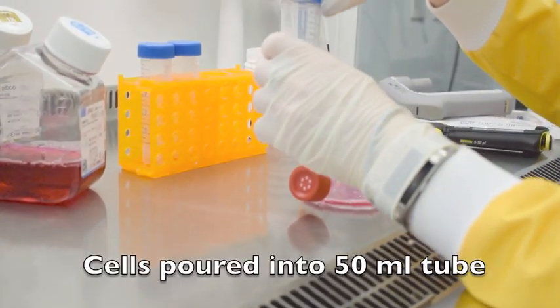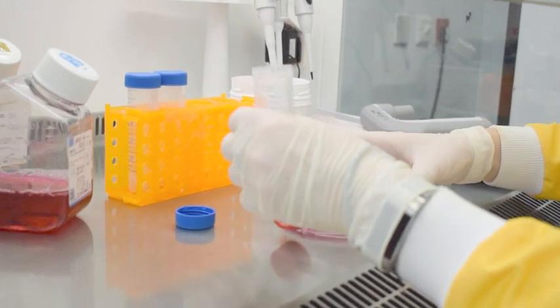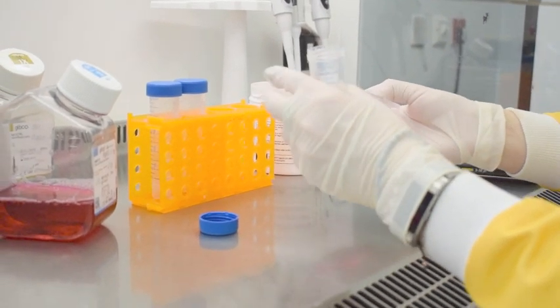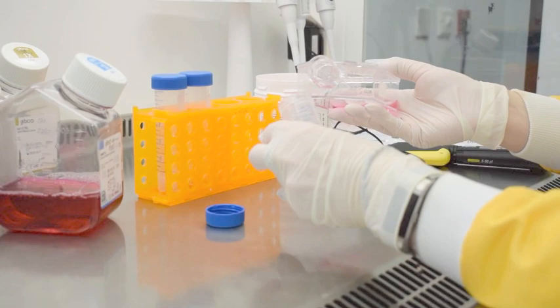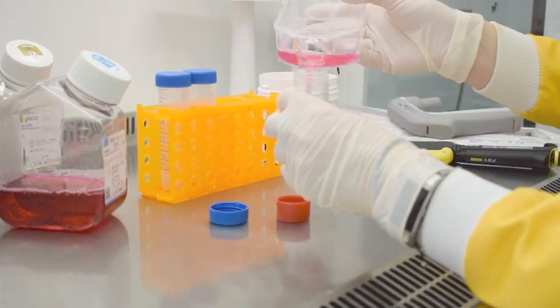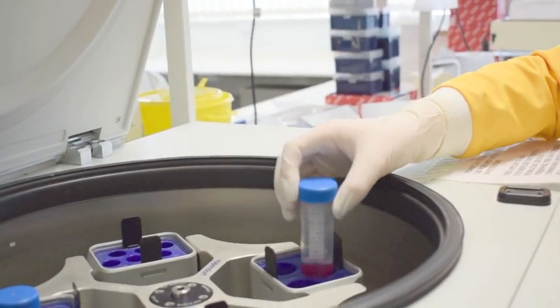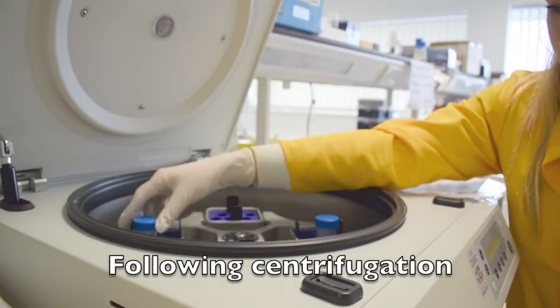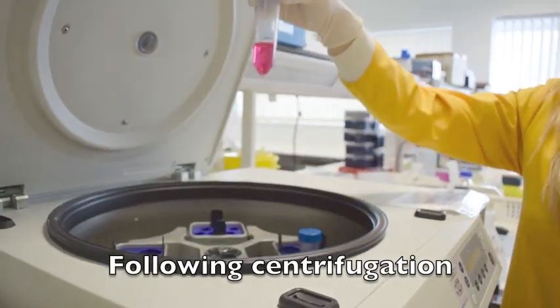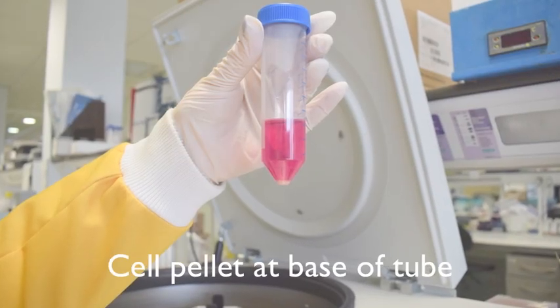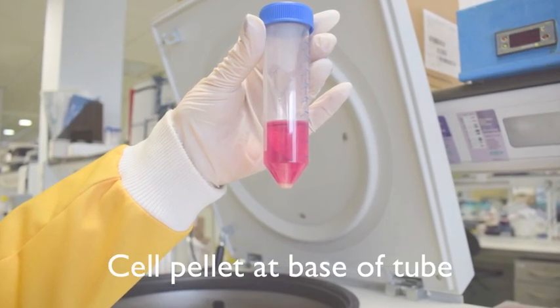The cell suspension is then transferred to a 50ml centrifuge tube and centrifuged for 5 minutes at 154 RCF. The cell pellet should be clearly visible following centrifugation.